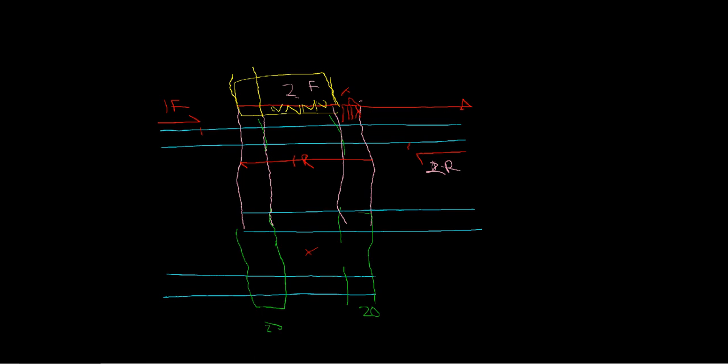And the same thing is going on here in this other reverse oligo, is we're getting a bunch of homology to our template right here. And it's just bringing along everything else for the ride. So it's bringing along our Ns and our 20 base pairs of homology. So that now we can kind of start to look at this thing in a different light. So we get N, N, N, and then we have N. So this is 4 Ns. Oh, that's a backwards N.